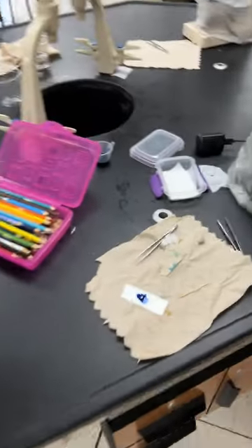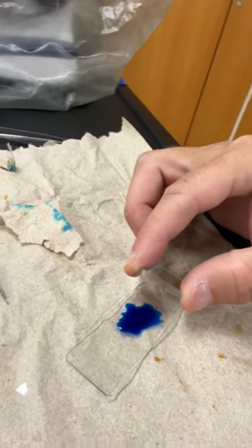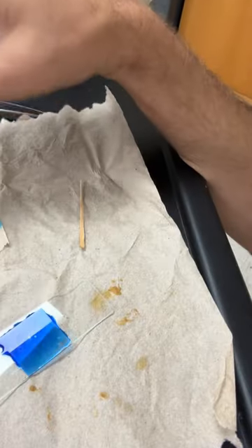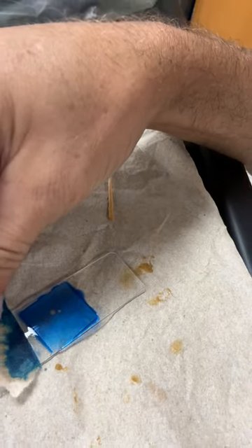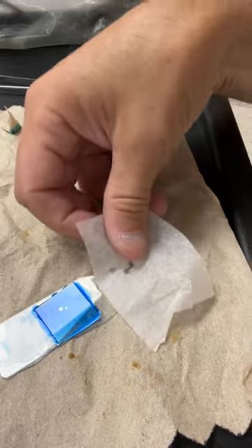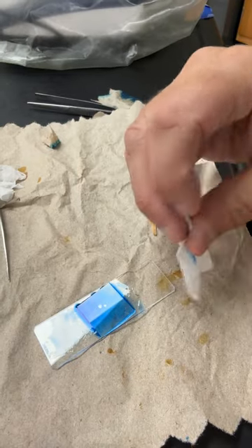We've let it set for a minute. Then you'll get your cover slip — if you don't have one, get it from Mrs. Watts. Put it on at a 45 degree angle, just like you usually do. If you notice anything coming out the sides, blot it with your paper towel and clean up the slide now rather than later, so we don't get stain on our microscopes.